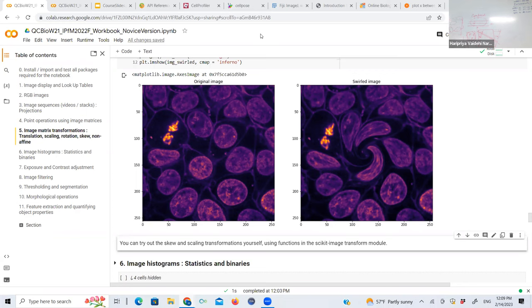Yeah, I think that's okay because, when you average or bin, I guess you're getting to an average that you couldn't get before. But I think before saying that, consider significant figures. Just be careful of the number of figures you actually have, which is not necessarily any other physical number.